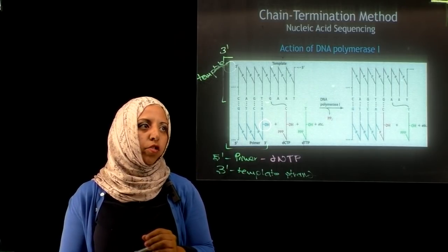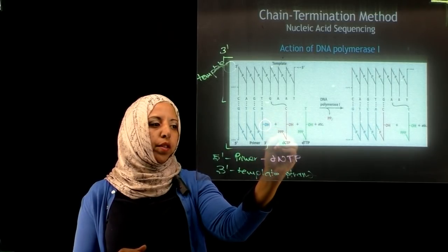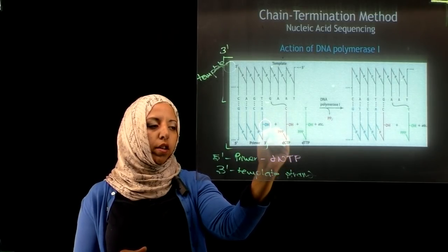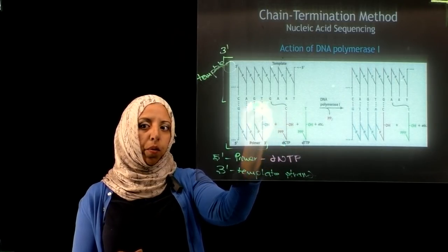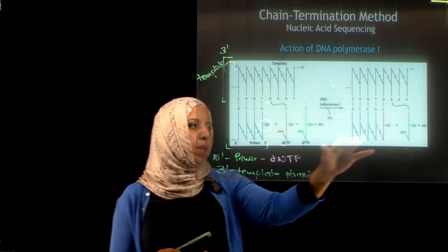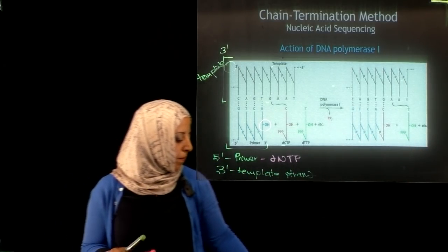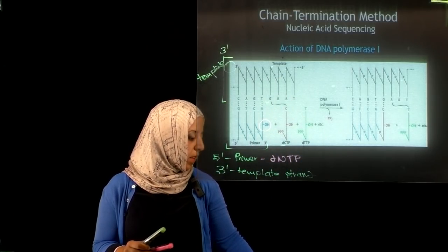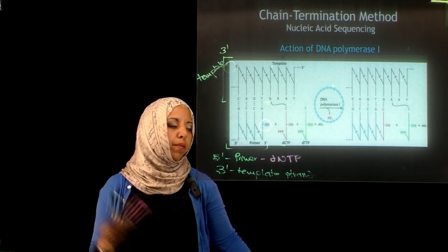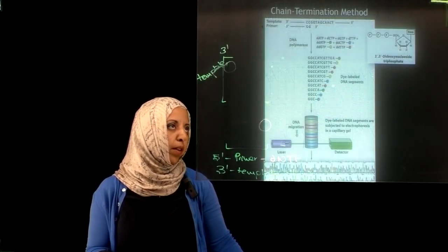nucleotide in the template strand is G, so it will pair with C, so deoxy CTP will add, form a phosphodiester bond, and base pair with G. The same thing happens up until the entire sequence. The complementary sequence of the template strand has been synthesized, and the enzyme is DNA polymerase.